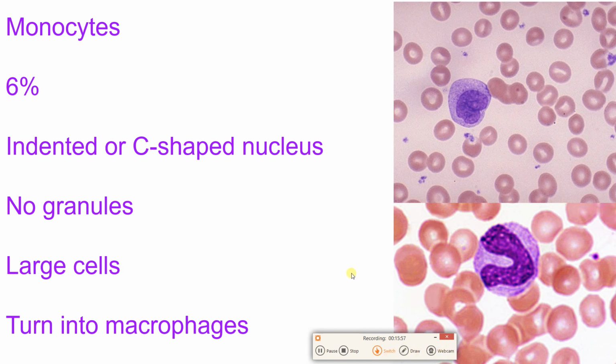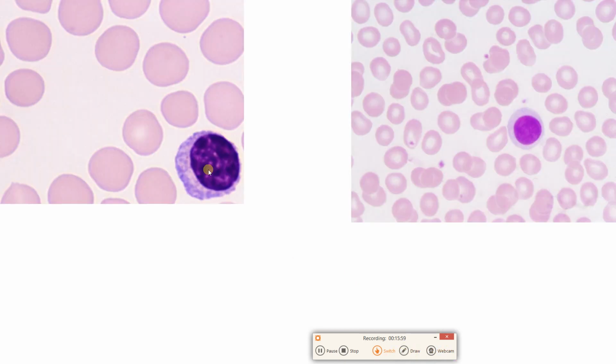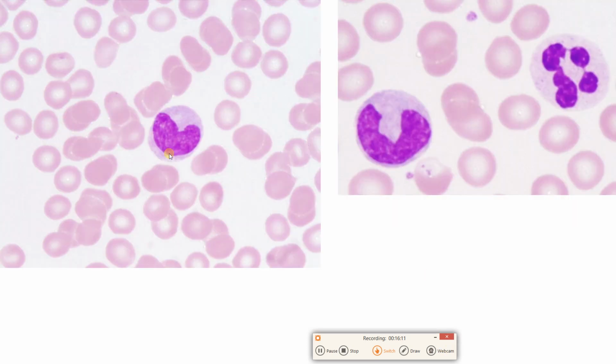All right. What do we got here? These are two lymphocytes. Not perfect circles, but fairly circular nuclei there. And this guy right here is a what? Dented nucleus. Same thing here, C-shaped nucleus. These are two monocytes. This right here is a what? It is a neutrophil.